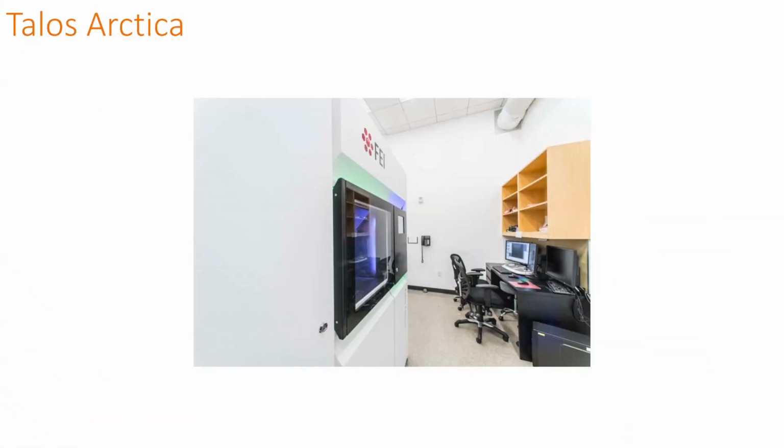After the grids are prepared, usually the first stop is on our Talos Arctica. This is a microscope operated at 200 kiloelectron volts and primarily used for screening, but can also be used for high-resolution collection of single particle data, as well as now micro-electron diffraction. It is equipped with a K3 direct electron detector and a CetaD camera for micro-ED.